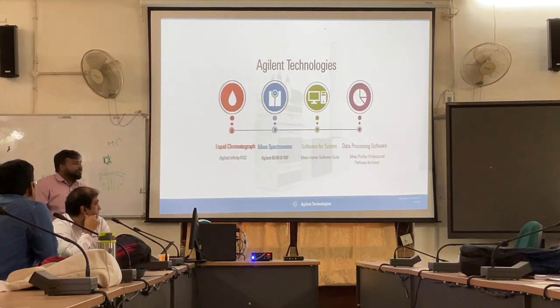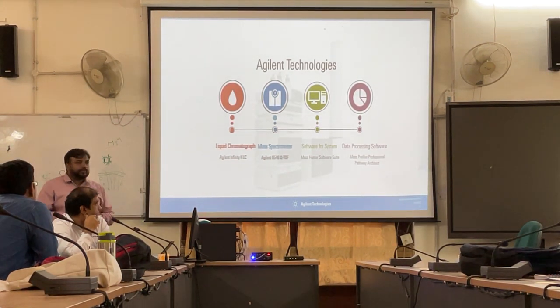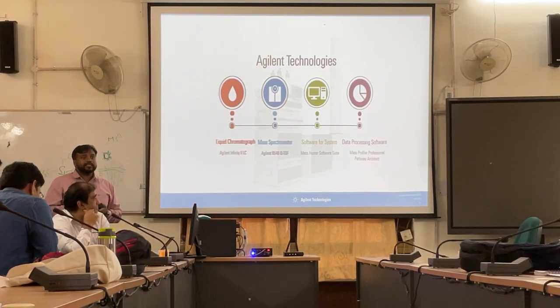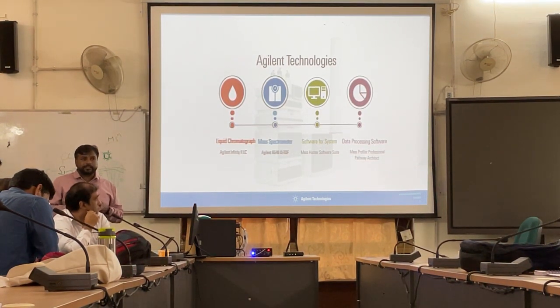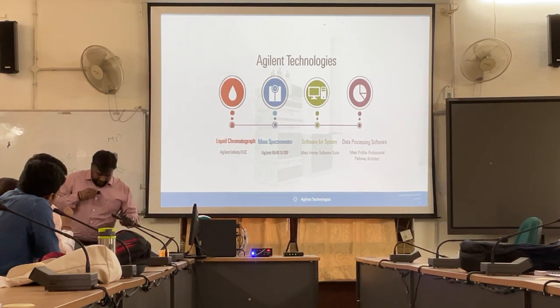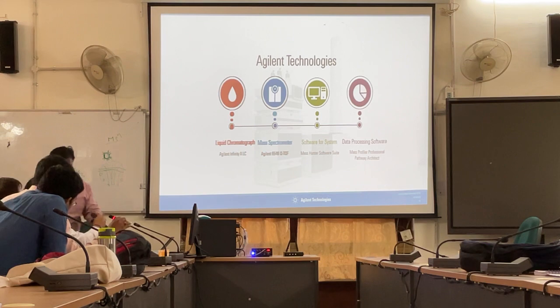Onwards, there is a software by which we control the instrument and define the method, and there is also some data analysis software, which will be covered by Saurabh. So I'll invite Saurabh. Okay.